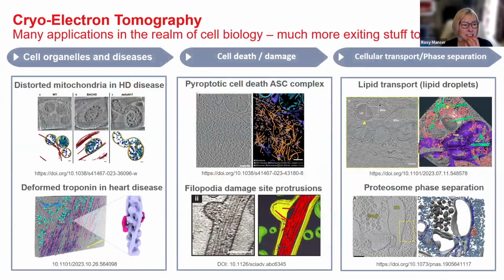So there are many different applications, and I hope I've at least inspired you a bit in terms of what possibilities there are in the realm of cell biology for tomography. For me, as a light microscopist by trade, I think it's incredible how this complements what we can do in light microscopy and in the rest of the volume EM techniques and technologies. And it's moving quickly. As I said, 15 years ago, this stuff was really, really hard. Being able to produce a lamella and get a good image using a cryo-TEM system was really, really difficult. Now it's becoming much more streamlined and therefore much more accessible for the multitude of users who would be interested to do it. And we're seeing high level publications coming through in great high impact journals, because it's just such new biology. So yeah, that was it for me on the cryotomography side of things.